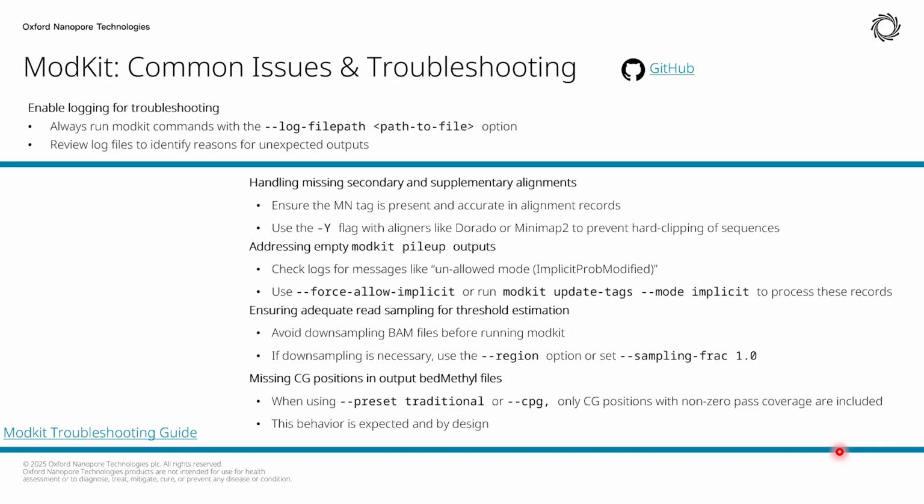Basically, it's about how you want to set thresholds for calling a site modified or unmodified. By default, ModKit will handle that analysis itself and will apply it to the runs that it's doing. But if you wanted to, you could manually set those and derive those yourself, depending on how stringent you want to be in calling sites methylated or unmethylated or modified, depending on the model that you're using. Yeah, I think it's good to revisit when you start using the software.